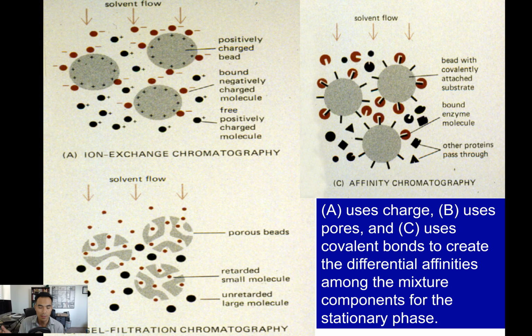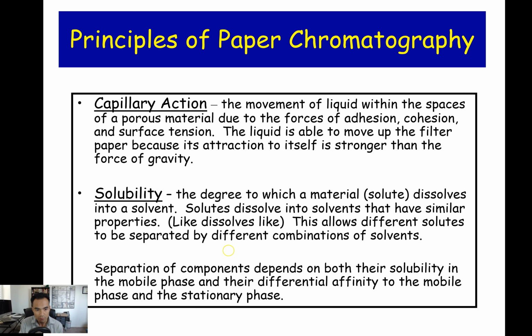This is the idea that liquid can travel up the paper because of this effect. Now, the concept today that you were intended to really think about is this idea called capillary action. Capillary action is the science that deals with porous materials, specifically the forces of adhesion, cohesion, and surface tension. Water has the ability to interact with this and create capillary action because it allows molecules to dissolve in it. Again, polar with polar, but more importantly, it allows water to stick to the paper and travel up using these three different forces.